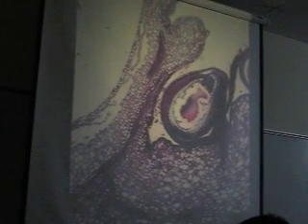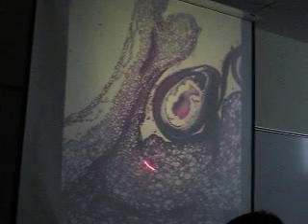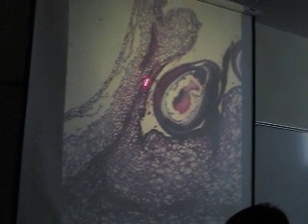Alright, then finally, not terribly important, but here it is. 23, that's a raspberry. Yeah, that's a strawberry. There's a little achene embedded in the receptacle. See the vascular tissue here?